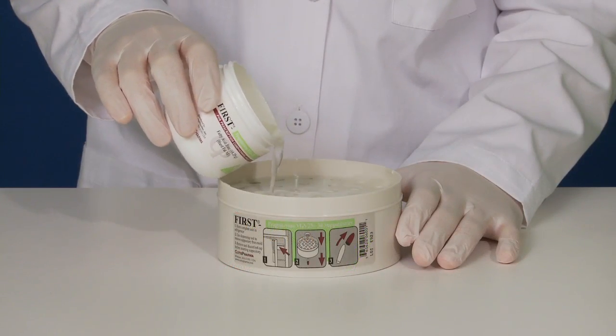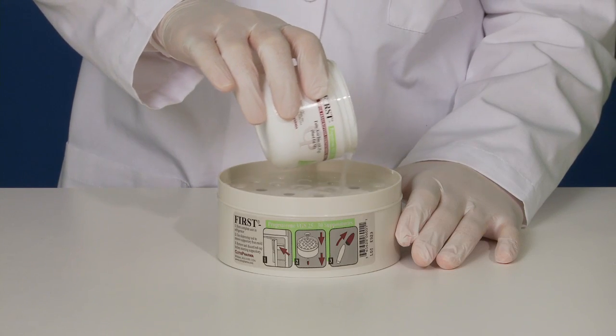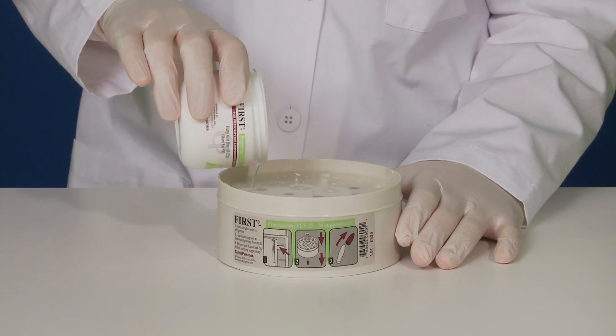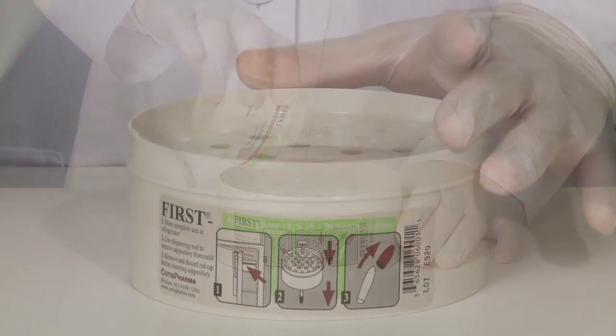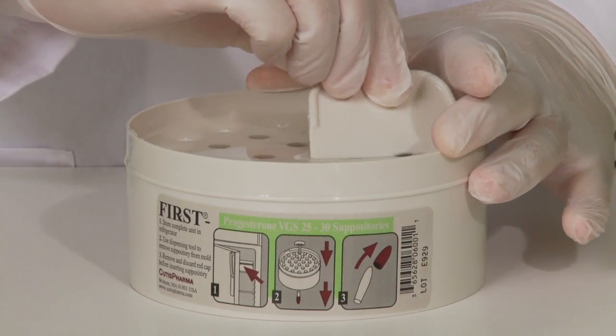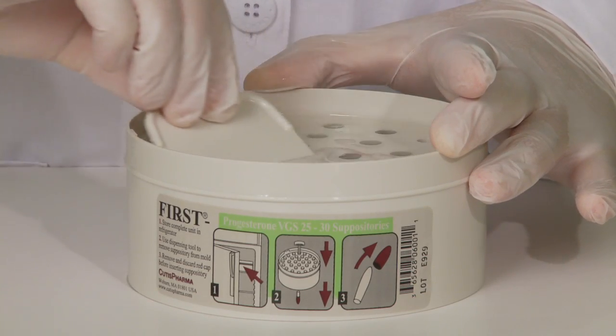Now carefully and slowly pour the entire suspension onto the 30-suppository mold in an even circular motion, covering all of the suppository cavities. Using the filling tool provided, finish by spreading the suspension over the cavities until they are all filled.